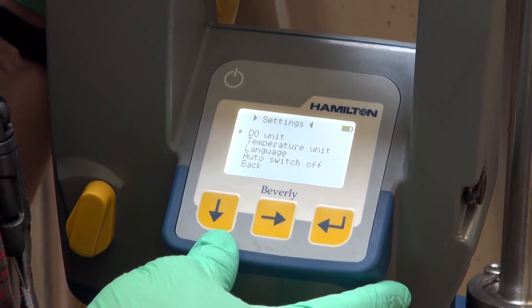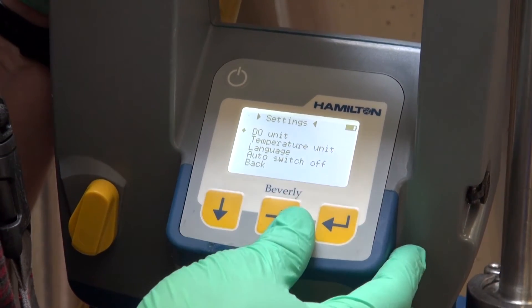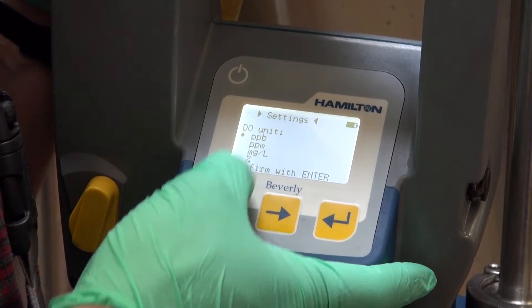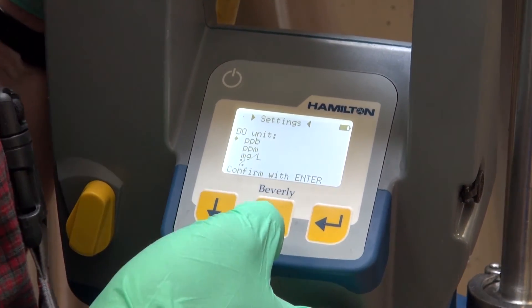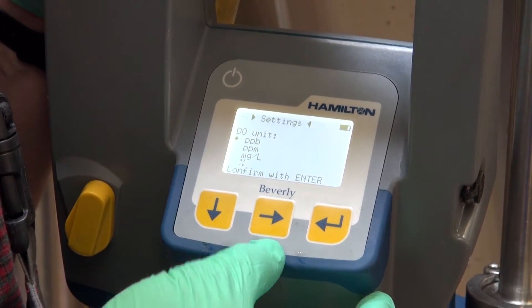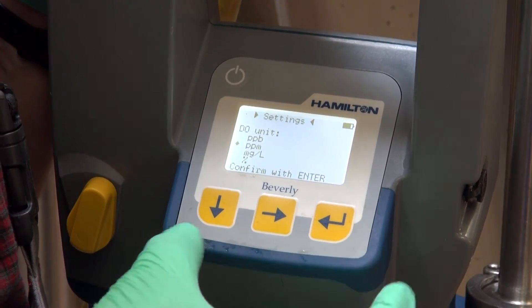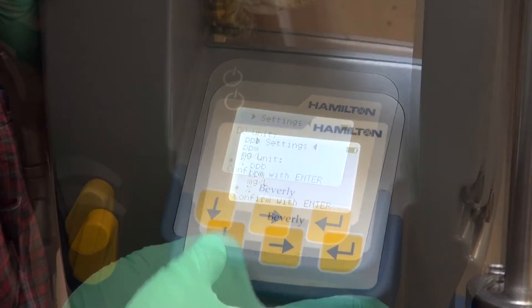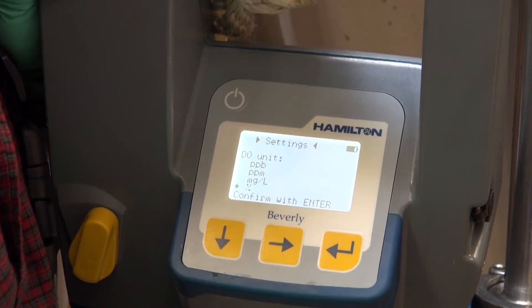The great thing about the portable DO meter is the versatility around the brewery as a whole. Looking at the different DO units: right now we've selected parts per billion, which we use for pre and post transfers of the beer as well as testing packaged beer. Going down to parts per million, the hot side of the brewhouse can use that to test the aeration of the wort. Then going down to percentage — that's for measuring the percentage of dissolved oxygen before a transfer during purging.